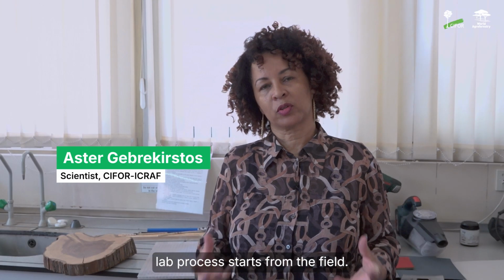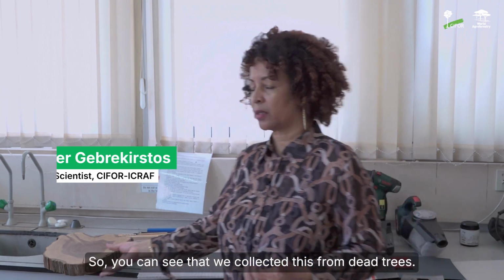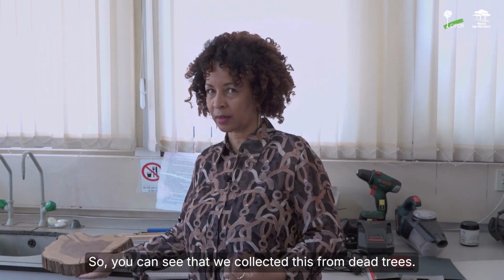The dendrochronology lab process starts from the field. The samples can be stem discs. So you can see like this, we collect them from dead trees.